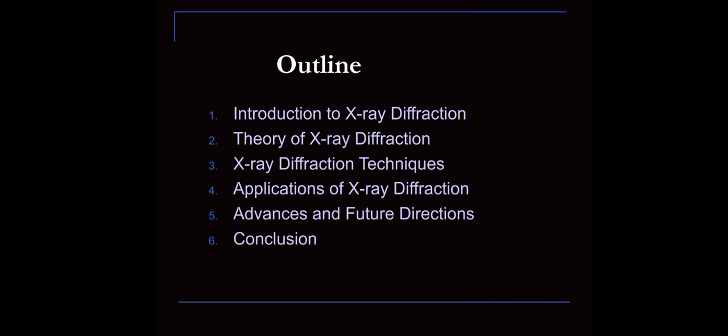First one, introduction to X-ray diffraction. Second, theory of X-ray diffraction. Third, X-ray diffraction techniques. Fourth one, applications of X-ray diffraction. Fifth one, advances and future directions. And the last one is conclusion.